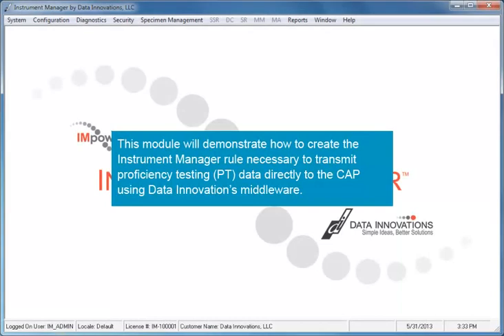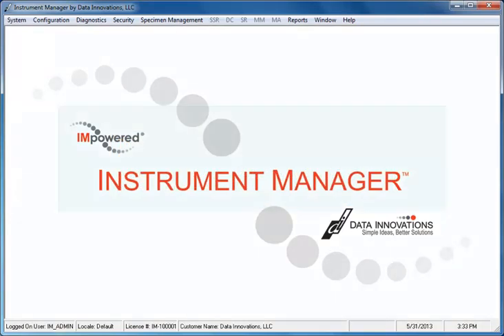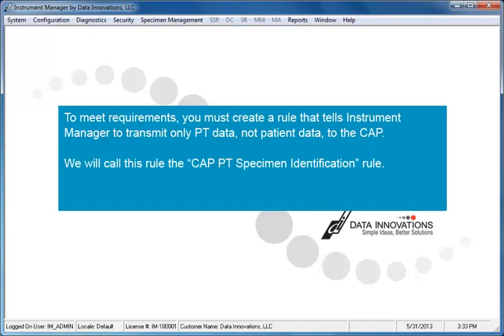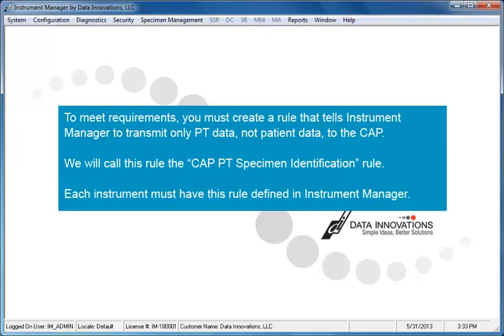The module will demonstrate how to create the Instrument Manager rule necessary to transmit proficiency testing, or PT data, directly to the CAP using Data Innovation's middleware. To meet requirements, you must create a rule that tells Instrument Manager to transmit only PT data, not patient data, to the CAP. We will call this rule the CAP PT Specimen Identification Rule. Each instrument must have this rule defined in Instrument Manager.